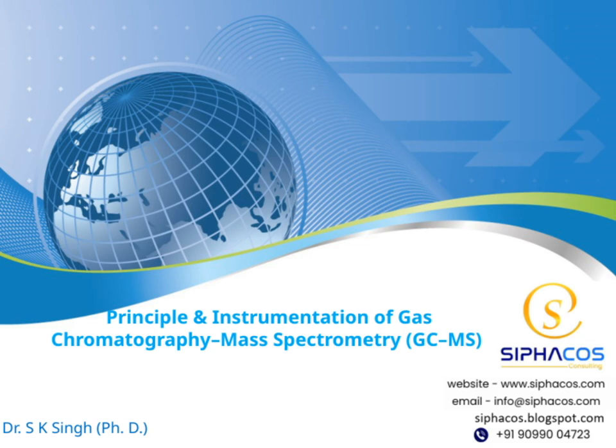Today, we'll be exploring the principles and instrumentation behind gas chromatography mass spectrometry, or GC-MS. Over the next few slides, I'll walk you through how this powerful analytical technique works and its applications. So let's get started and dive into the fascinating world of GC-MS.